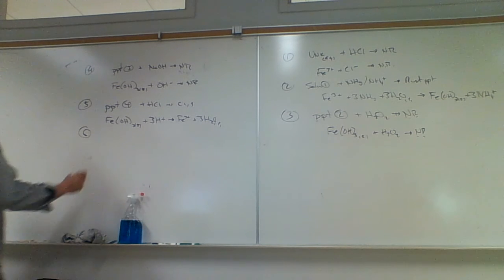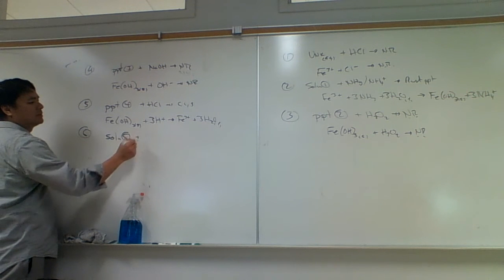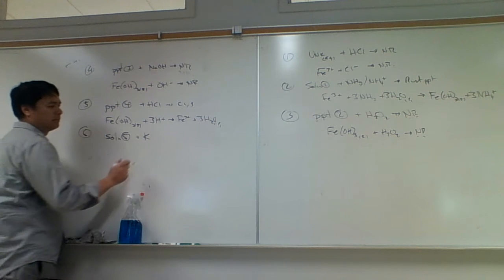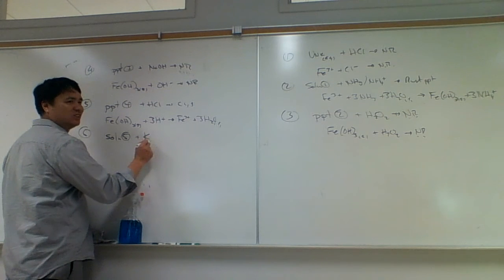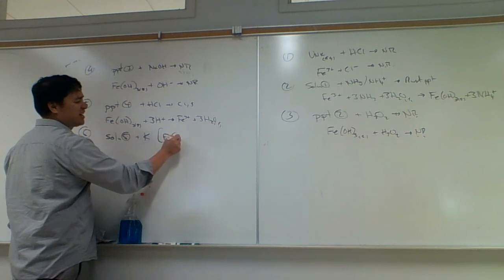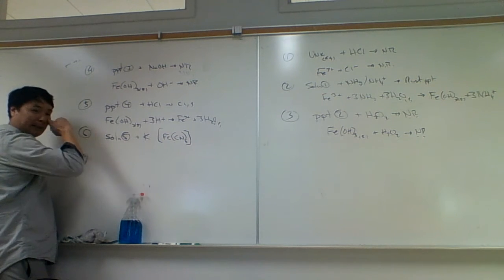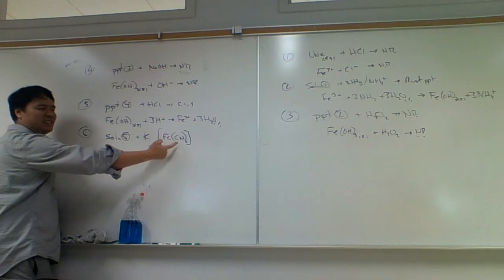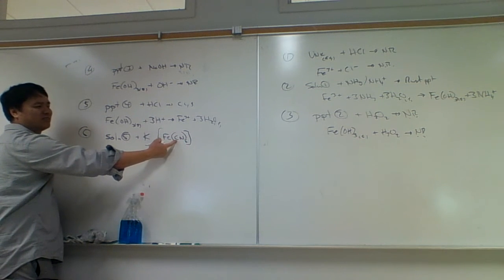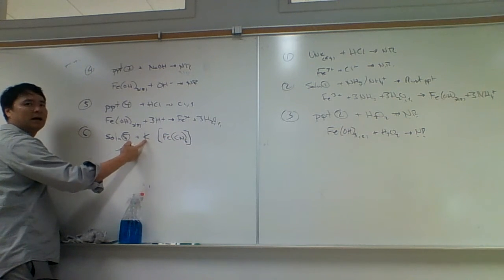All right. And so what we'll do is we'll take this solution from 5 and then add potassium hexacyanoferrate. What's the charge on iron there? Is it iron 2 or iron 3? And the way we can tell is based on the formula. And so there's 6 cyanides here. And depending on how many potassiums we have here will tell us the charge on the iron. Because each cyanide is -1, and so this is -6. -6 plus something is going to give us minus something, which we have to balance out with potassium.